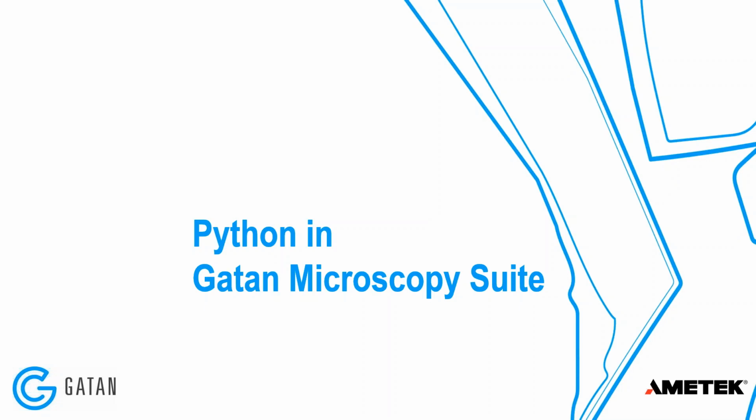I really have no formal computer science or programming training either. I'm a microscopist by training, a material scientist. But as I'm collecting and processing and analyzing data myself or working with data from collaborators, I often want to do things that really can't be done without scripting. And it's something I enjoy, so I tend to write scripts.